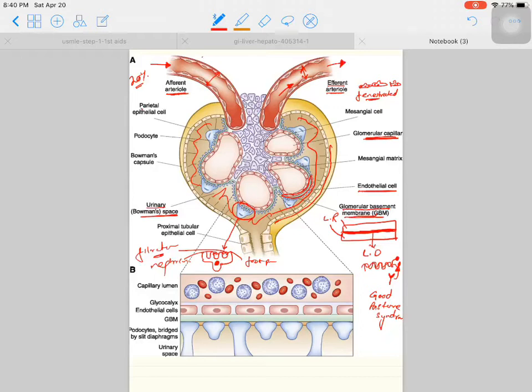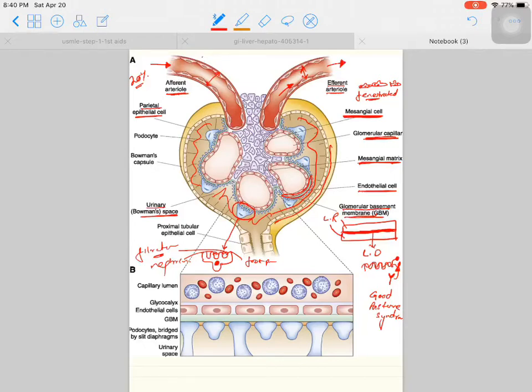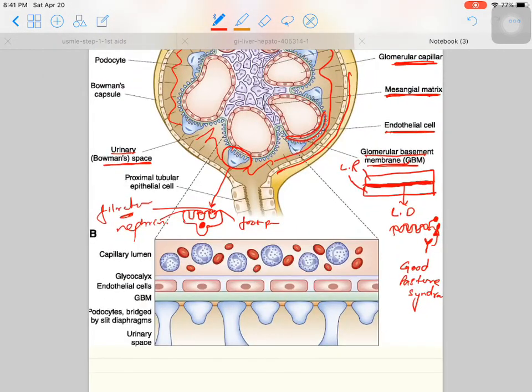In the interstitial space between the capillaries we have mesangial matrix, which contains collagen fibers and many other substances. There is also a special type of cell here that acts as a macrophage in cases of inflammatory processes. It also helps in the synthesis of collagen fibers and regulates the glomerular filtration rate. This is an overview of the glomerulus.